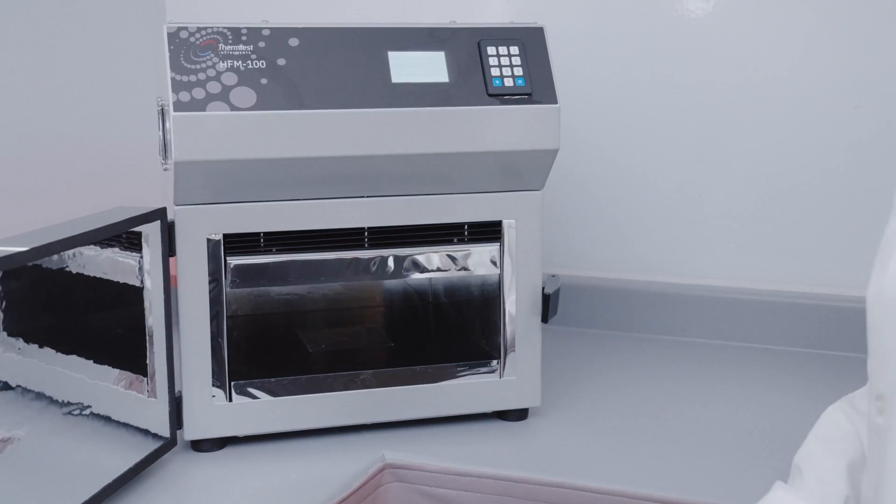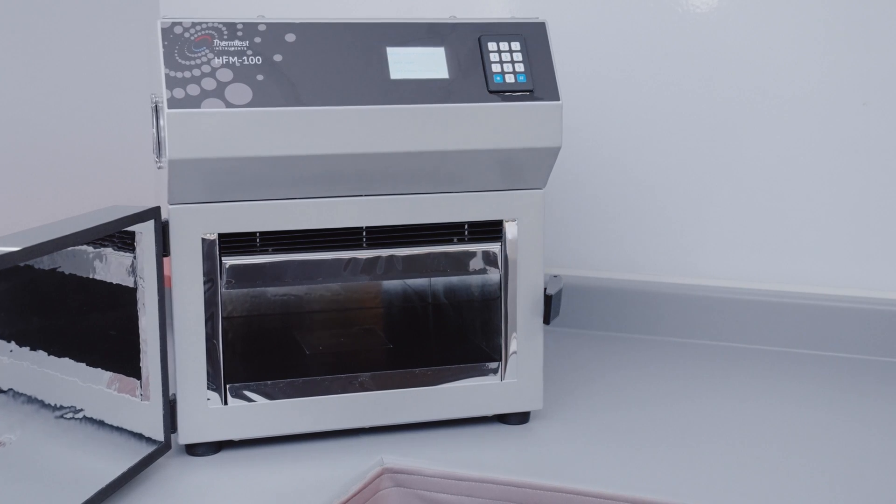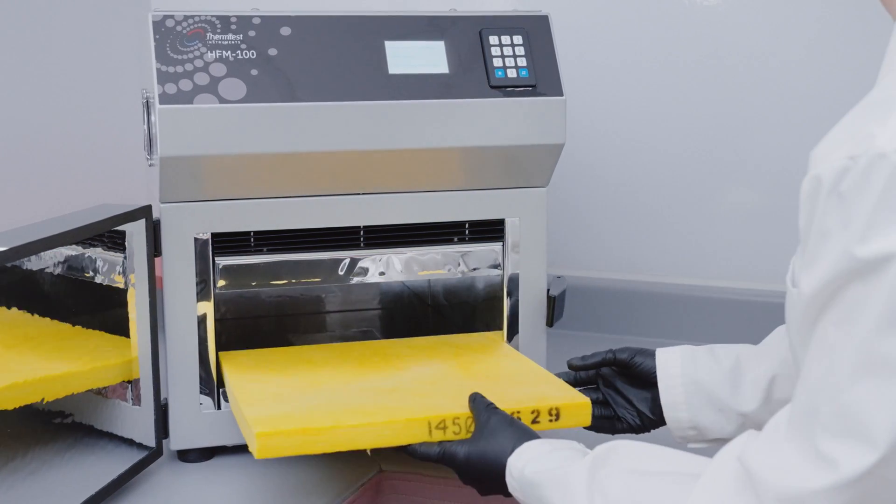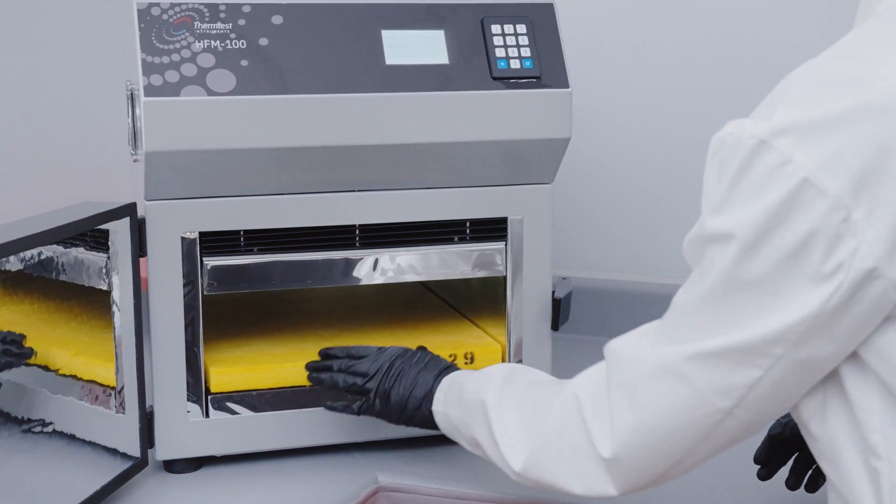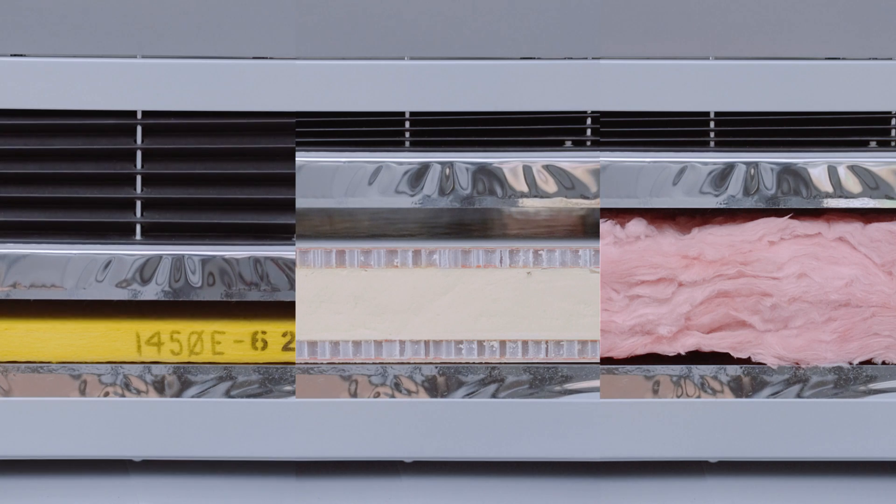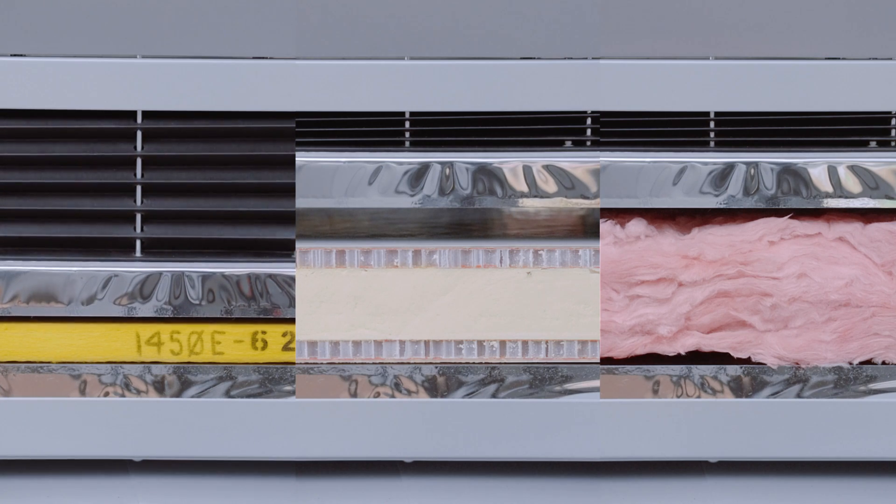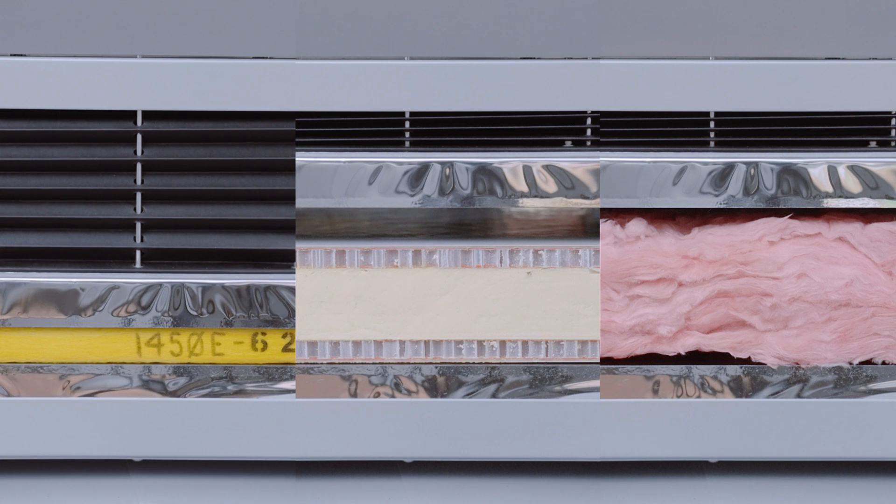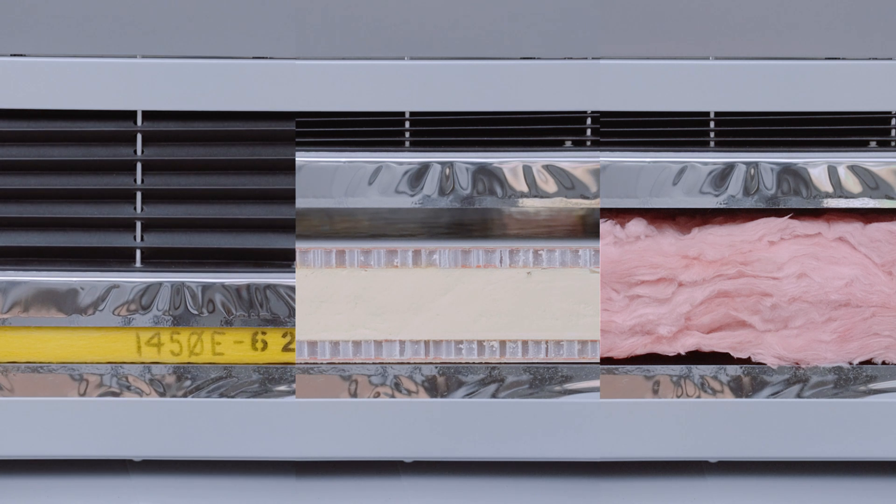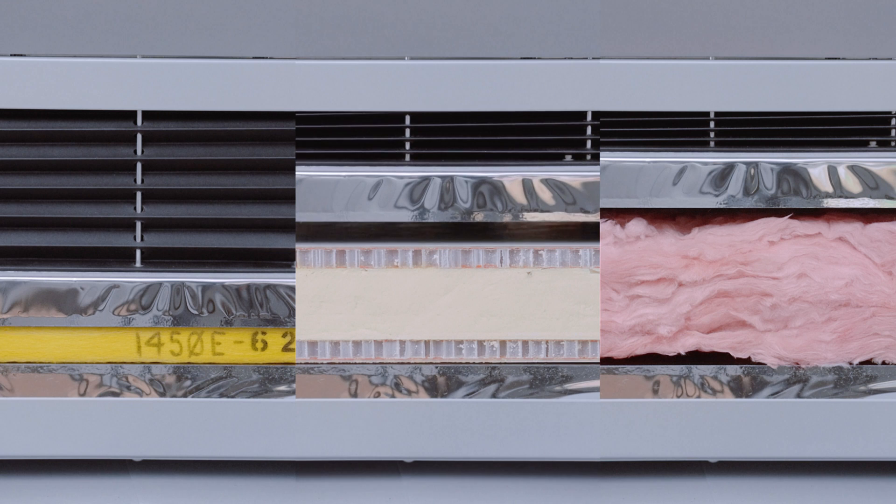The HFM 100 is able to test samples up to 300 by 300 by 100 millimeters in dimension. The through thickness measurement of thermal resistance and thermal conductivity is ideal for testing complex layered structures and heterogeneous samples which are typical to the construction industry.